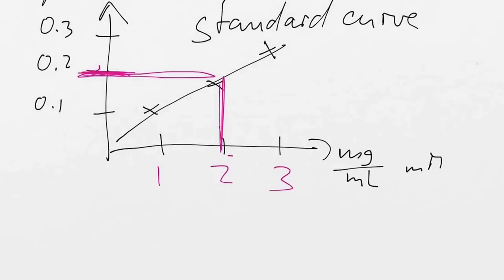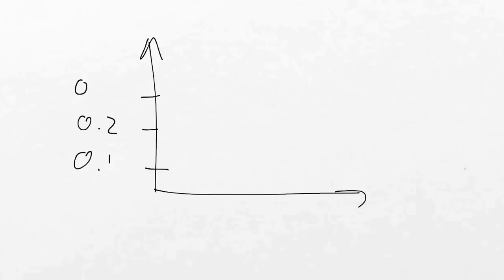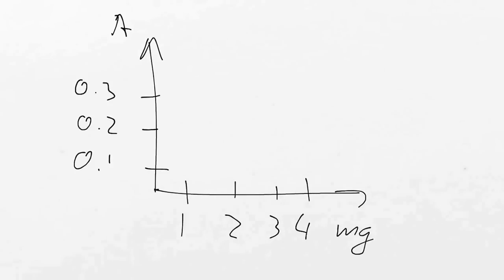Okay, now, last thing for today. Here is my standard curve. Absorbance. And here's my concentration. Okay? That is my standard curve.